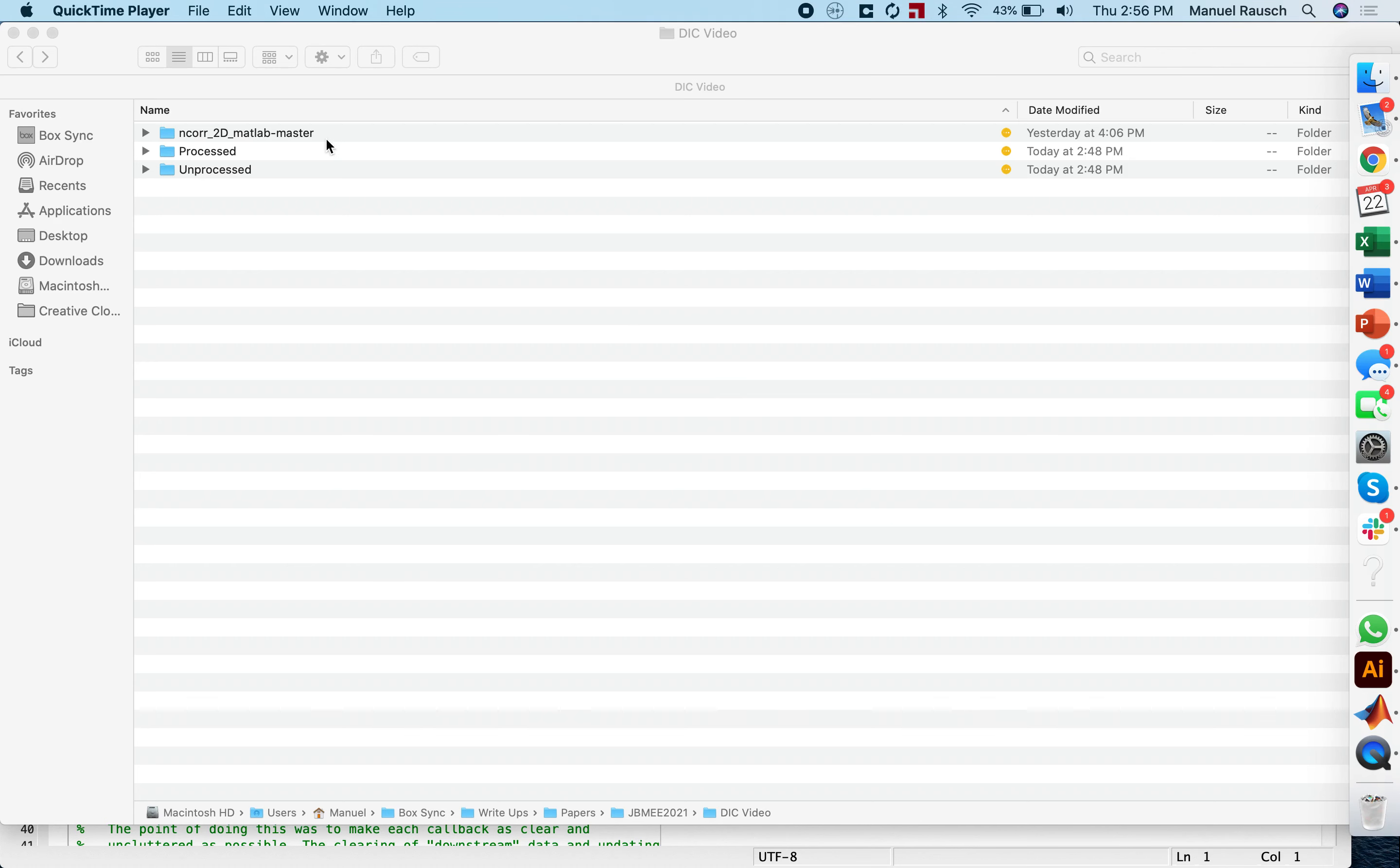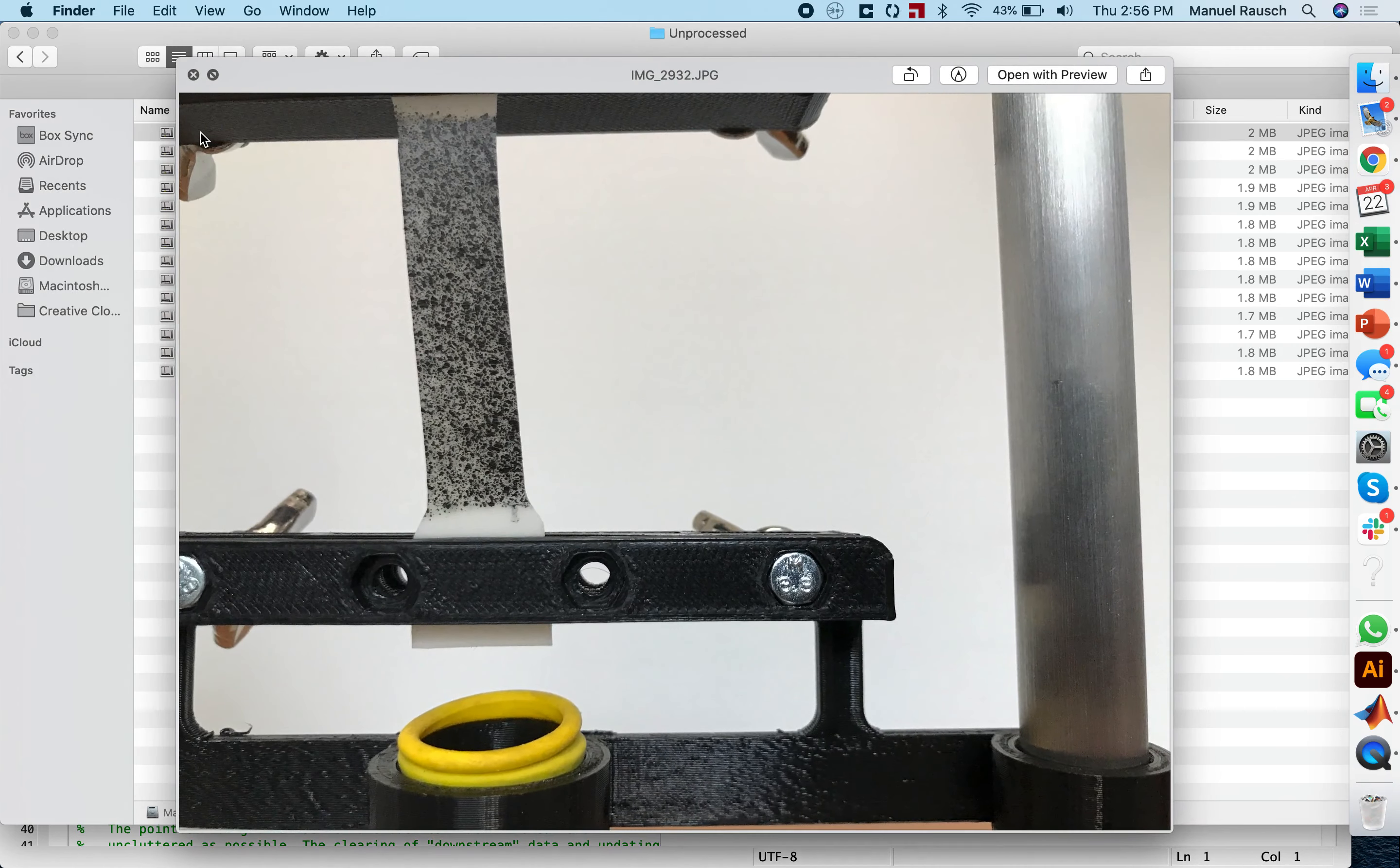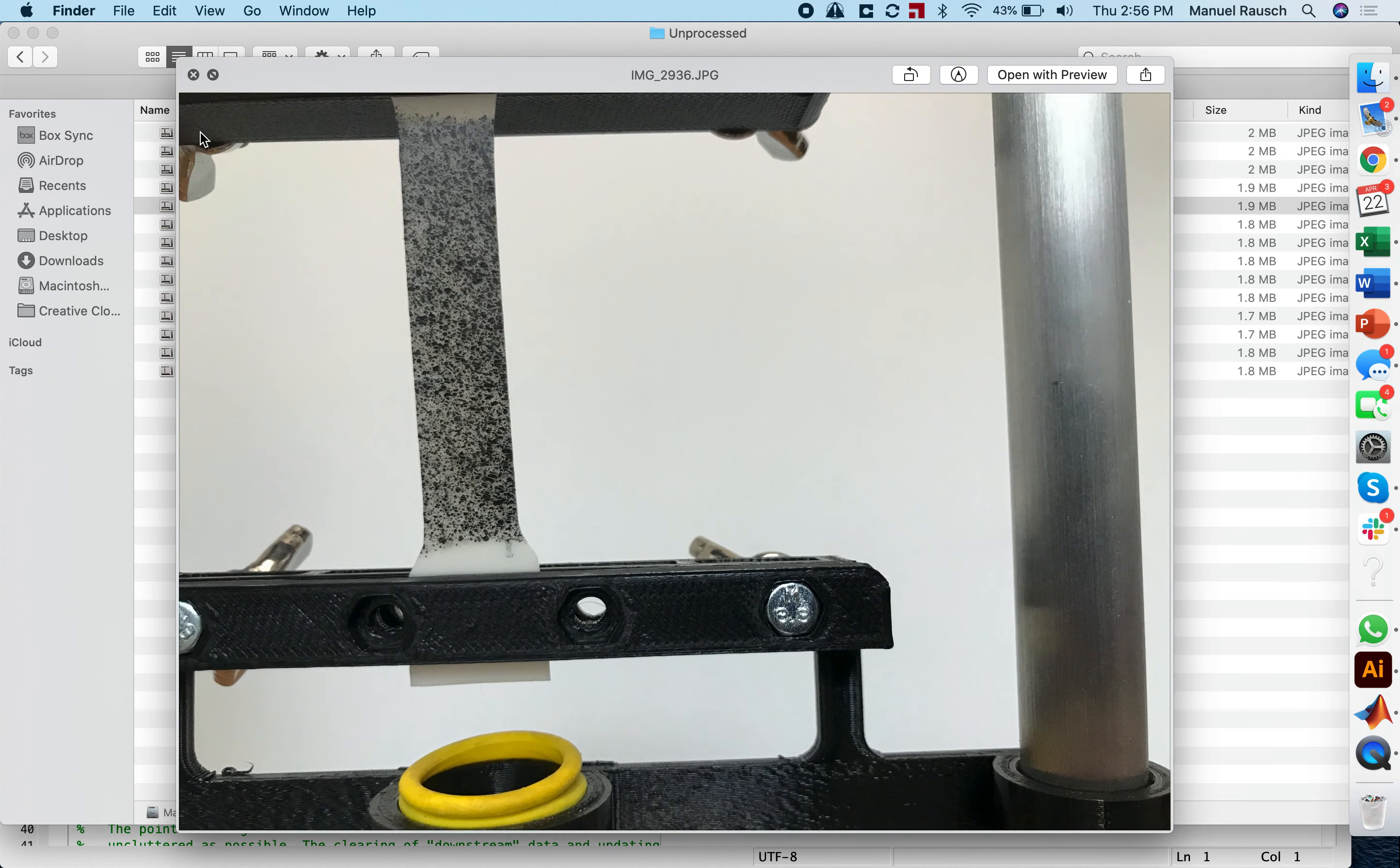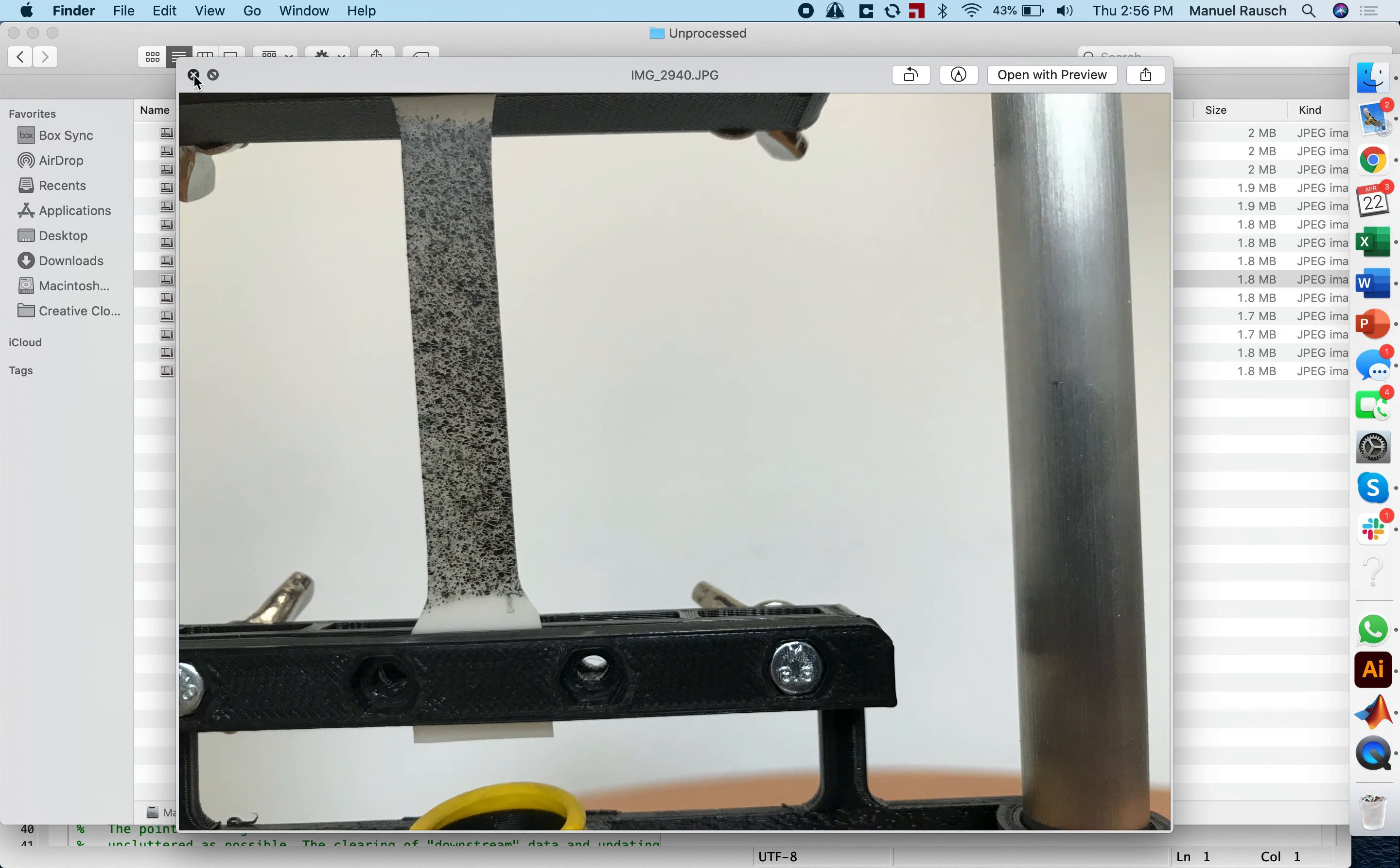I created two folders in my default folder here, one with the unprocessed images, so these are the images that I just transferred to my computer. You can look at them and you can see the speckle pattern quite clearly here. I use the AirDrop because I'm working with a Mac and iPhone, but I'm sure you have your own ways to transfer images from your phone to your computer.